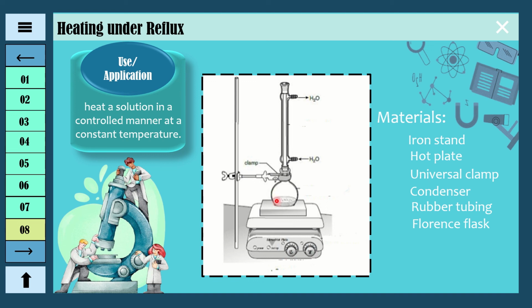The ring will not form unless the solvent is boiling at a steady state and not too fast. The point at which the rate of evaporation equals the rate of condensation determines the ideal rate of heating.